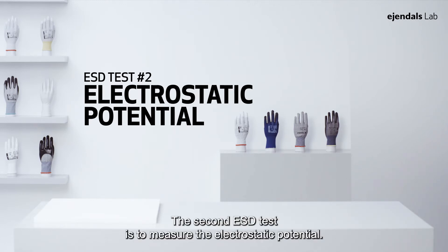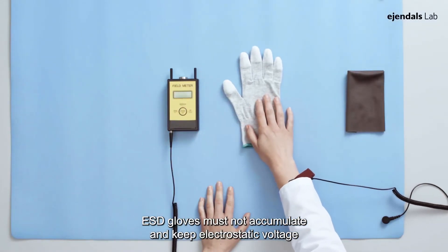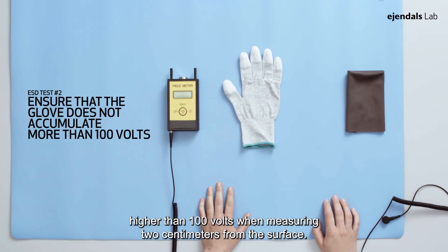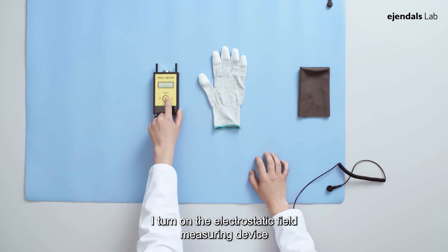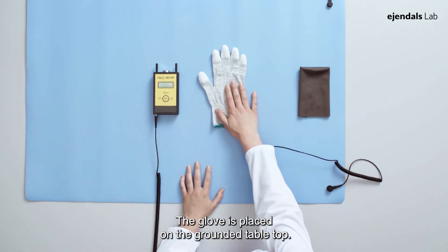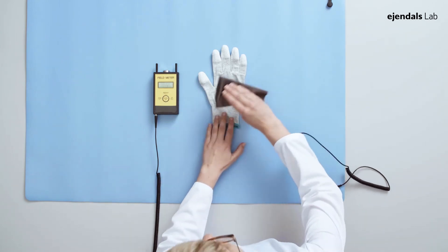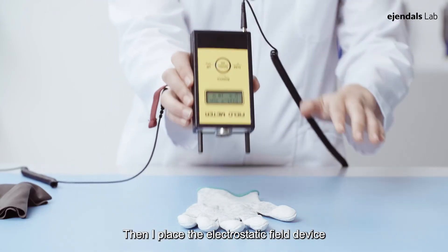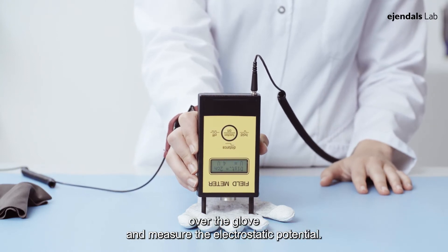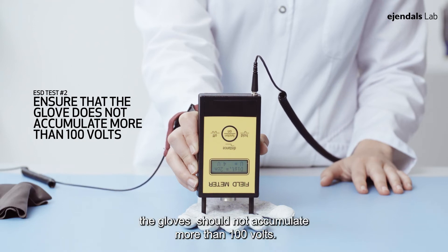The second ESD test is to measure the electrostatic potential. ESD gloves must not accumulate and keep electrostatic voltage higher than 100 volts when measuring 2 cm from the surface. Here are the steps in the measurement. I turn on the electrostatic field measuring device. The glove is placed on the grounded tabletop. I touch with hand or cloth on the glove. I wait 2 seconds. Then I place the electrostatic field device over the glove and measure the electrostatic potential. To pass the test, the glove should not accumulate more than 100 volts.